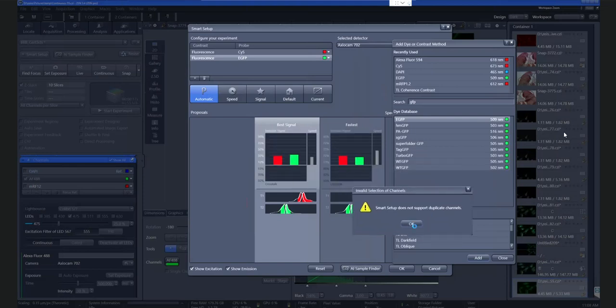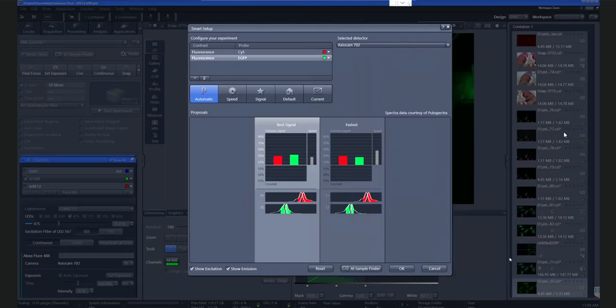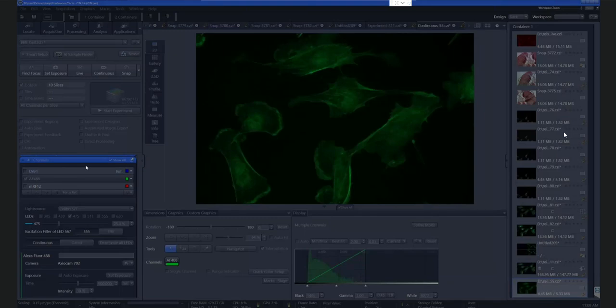Okay. Sorry, I just do not want to do it now. Okay. Let's do it now. Okay. Here.